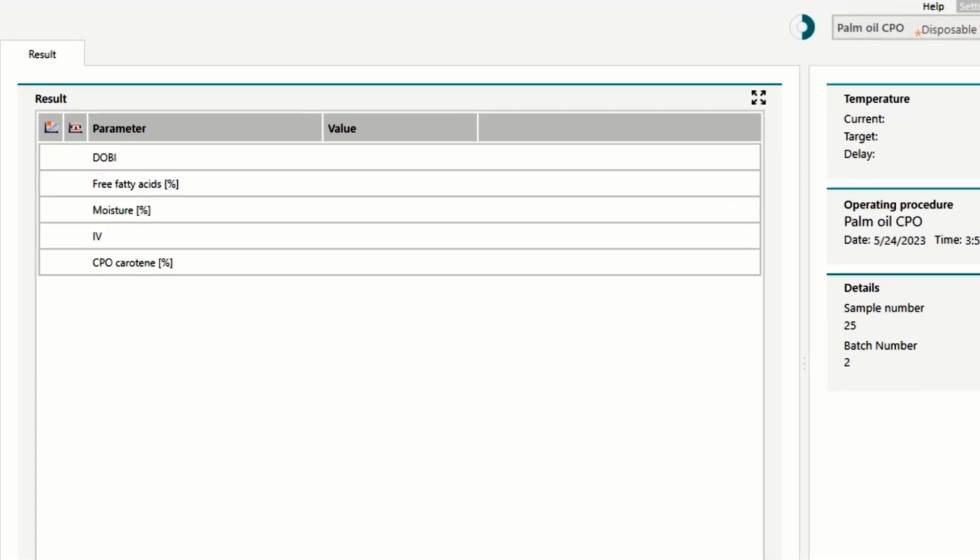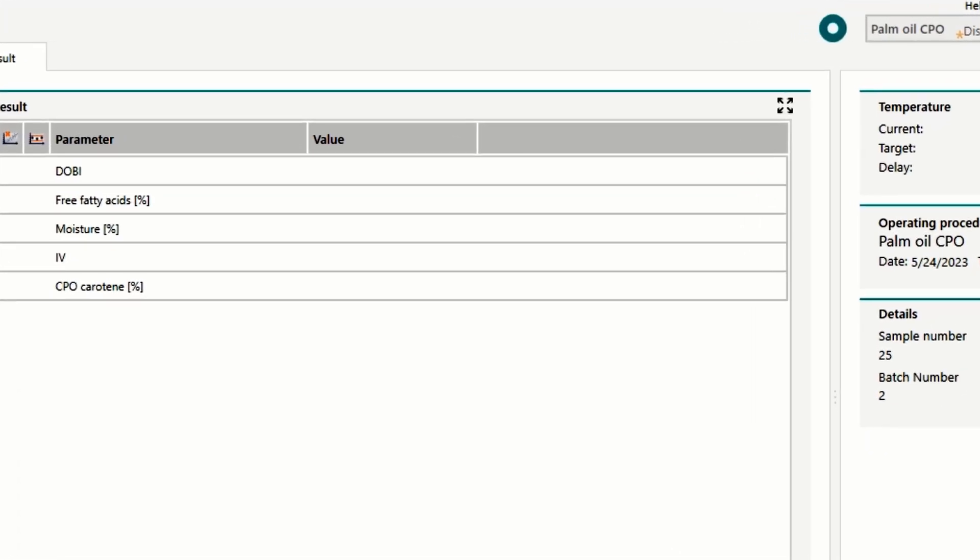In less than one minute, the iodine value, moisture, and free fatty acid content of the measured sample are displayed. To obtain these values, a pre-calibration based on more than 600 customer samples is used.